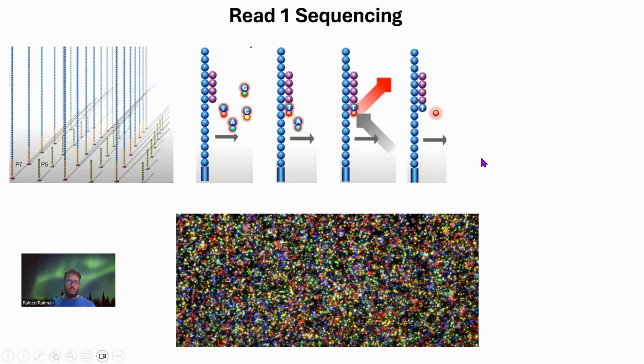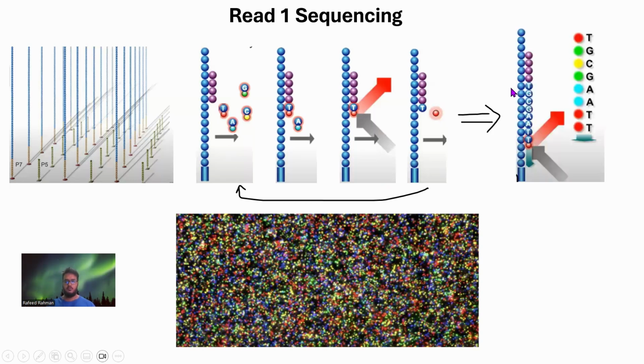So we have to keep doing this until we reach the end of the strands. So we have to loop over this. We have to keep doing this. And after finishing, for this particular strand, maybe this will be the sequence of complementary bases. So we can easily infer this particular original strand, and these will be the lights that will happen gradually in the cycle.